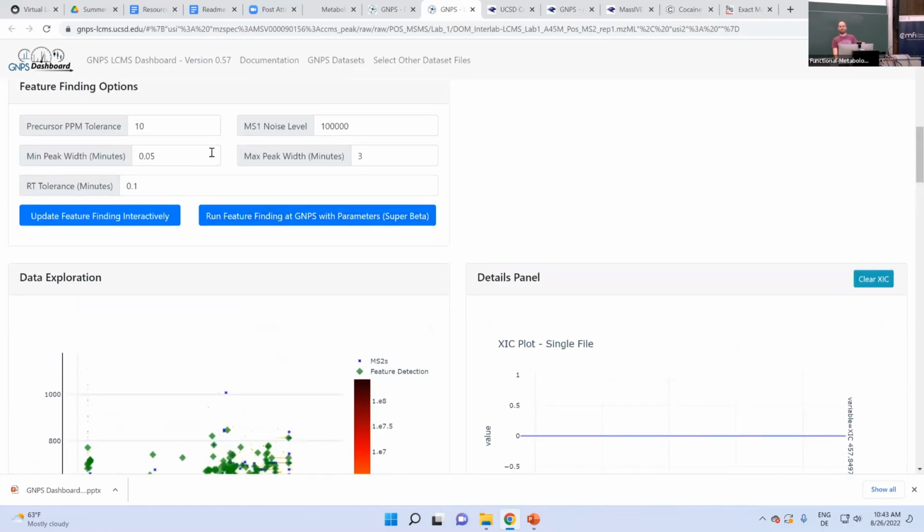So now you could use that as a threshold for your data analysis in MZmine 3, because those initial noise thresholds are critical. Mass tolerance and retention time tolerance, we already know from our instrument and chromatography performance, so there you don't change too much. You may change things within these boundaries, but that threshold is really critical.